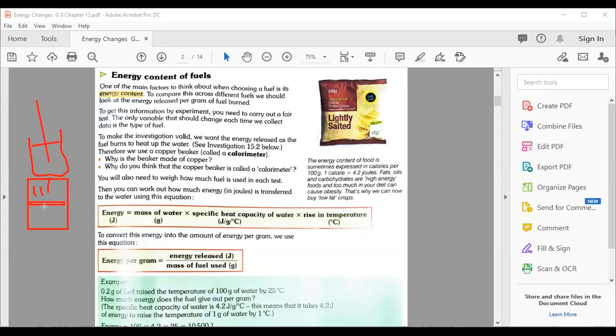After burning the fuel, maybe you took 1 liter of fuel, okay? When you start to burn this, and all the fuel is burned, you will see how much the temperature of the water rose, from the reading on the thermometer that you dipped in that water. I just gave you this simple example, but actually we are going to perform another practical.